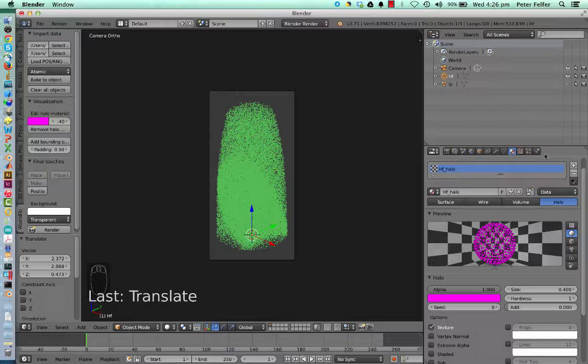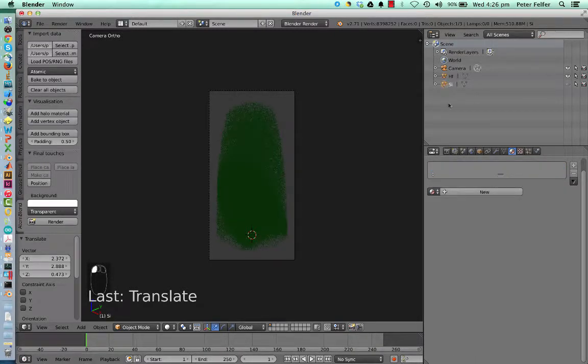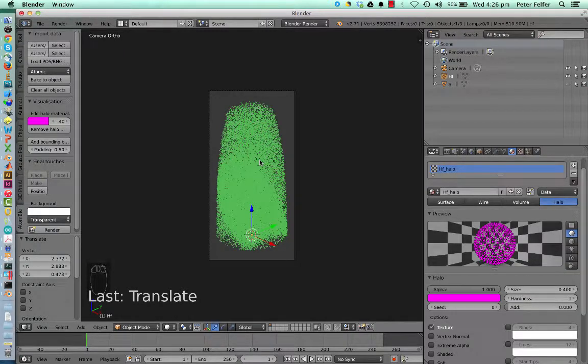Just to show you what it looks like for the silicon, if we would click on the silicon, there's no material defined yet. But we're going to do something else maybe with the silicon. Let's see how this tutorial goes. It's not defined by itself. You actually need to go and define it. But we've actually done the hard work for you, as I said. So you just click a button and the material is there and set up for you.